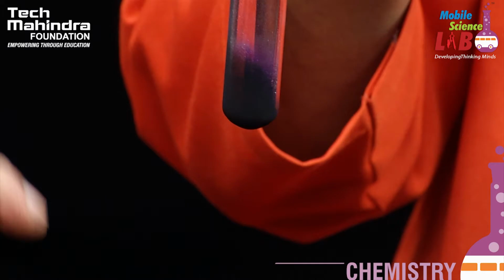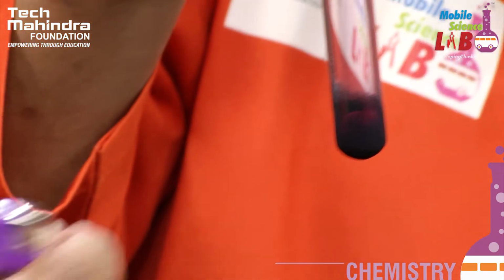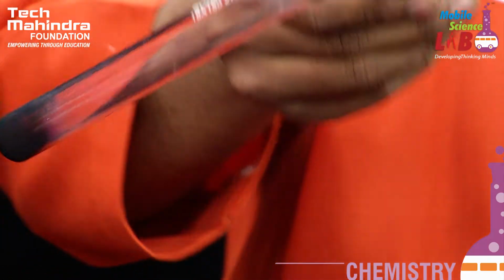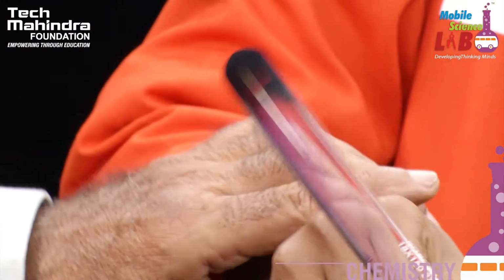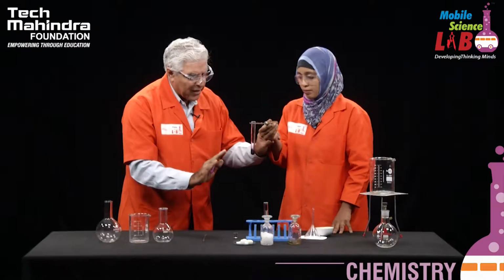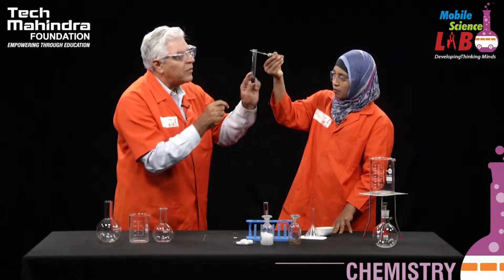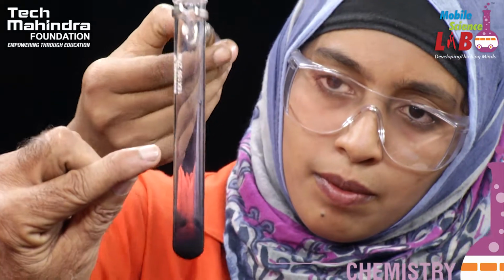Wow, sir. Now you can see that it looks black because of the smoke. Now invert the test tube and you can see that vapor color coming over. Now just keep it straight again and you will be able to see specks of iodine which have collected over here. Fine, small crystals of iodine.